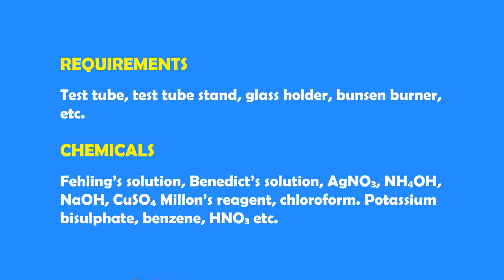Chemicals: Fehling's solution, Benedict's solution, AgNO3, NH4OH, NaOH, CuSO4, Millon's reagent, chloroform, potassium bisulfate, benzene, HNO3, etc.